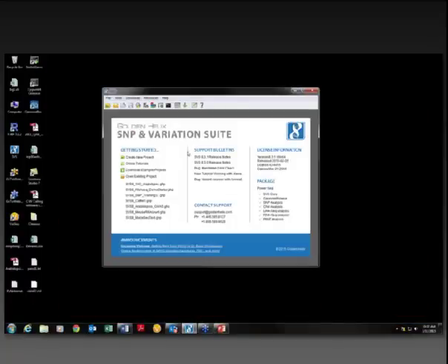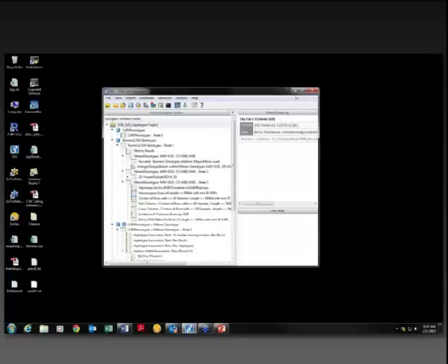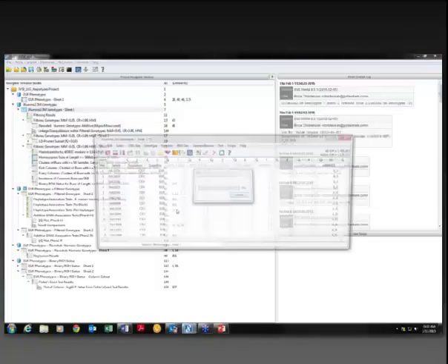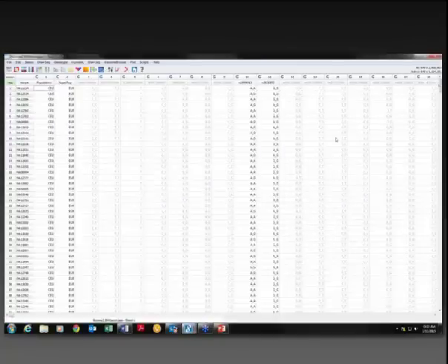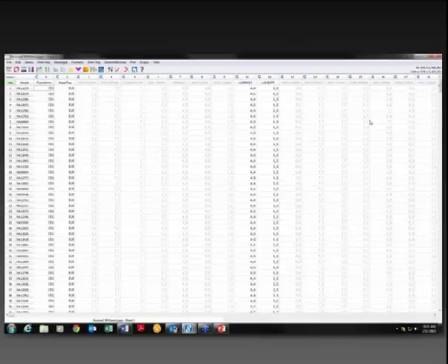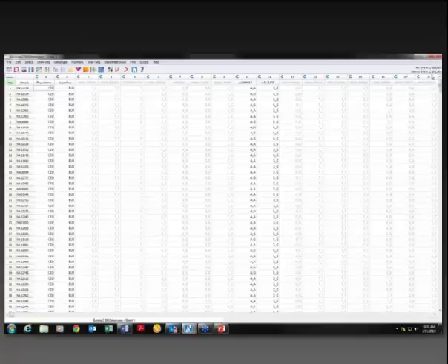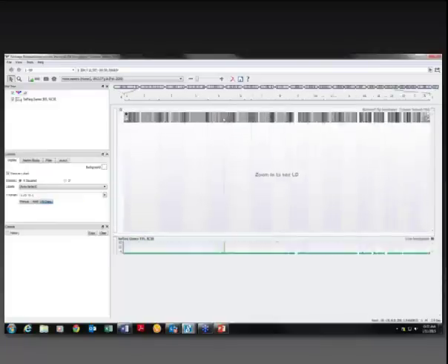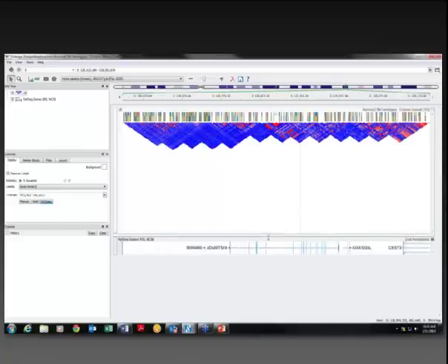SVS is a project-oriented software tool. I'm going to open a project that already has a lot of data in it. The data we're looking at today is from the Illumina 2.5M genotyping platform, from the 1000 Genomes Phase 3 project. I've selected just the European samples — 649 of them. The entire SNP set consists of about 2.5 million SNP markers. I applied some simple filters based on call rate and allele frequency, reducing it to just over a million highly polymorphic SNPs.